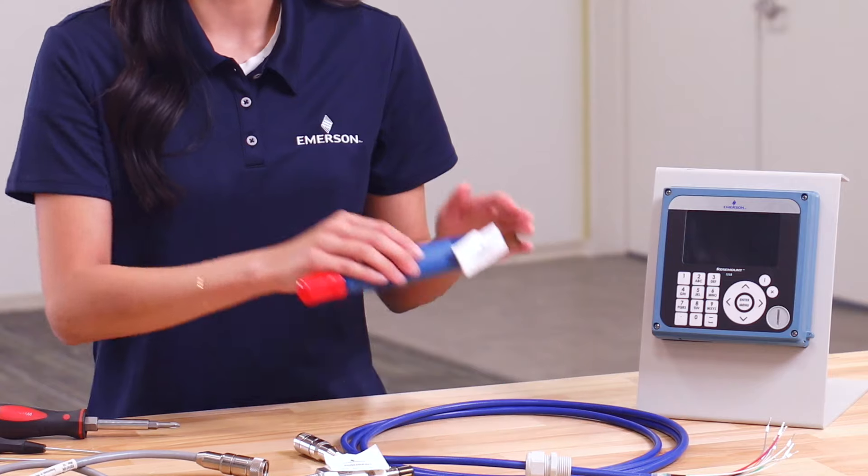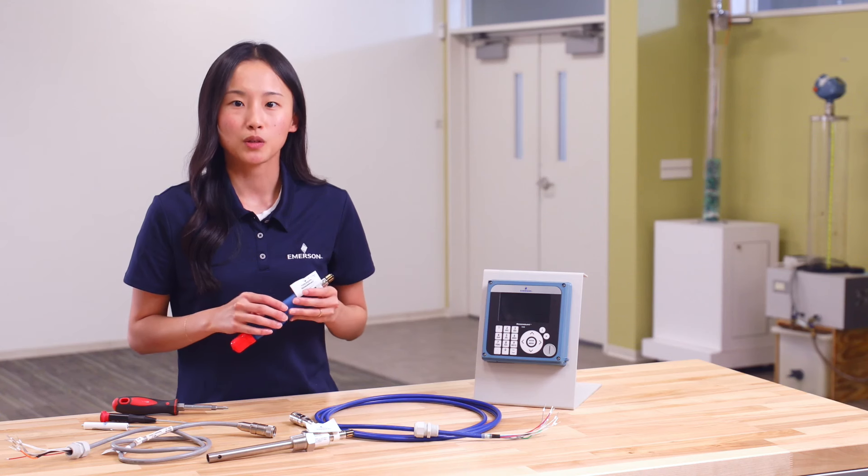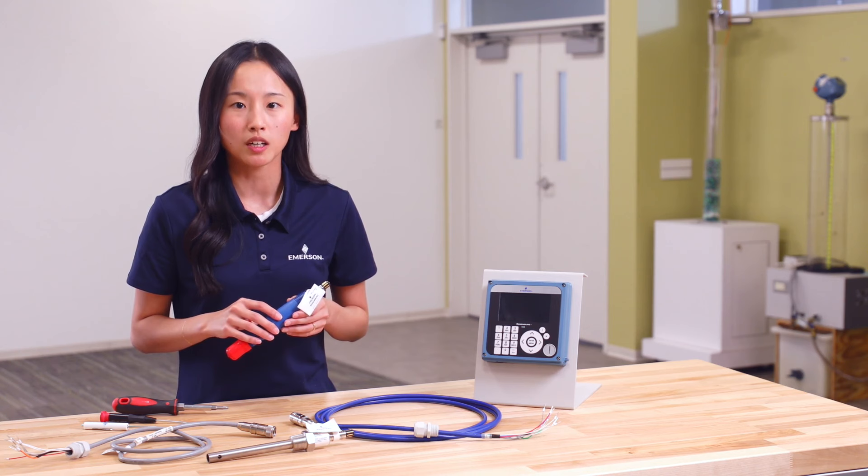I will start by demonstrating how to connect the Rosemount 3900BP PH/ORP sensor to the Rosemount 1058 transmitter. The wire connections required between the PH/ORP sensor and transmitter depend on the transmitter model, the sensor model, the sensor cable color, and whether the sensor has a pre-amplifier.